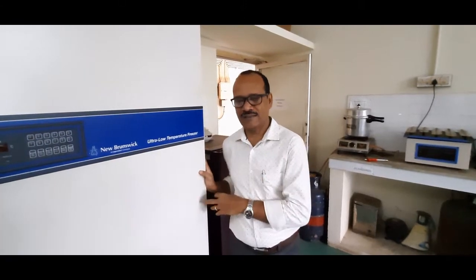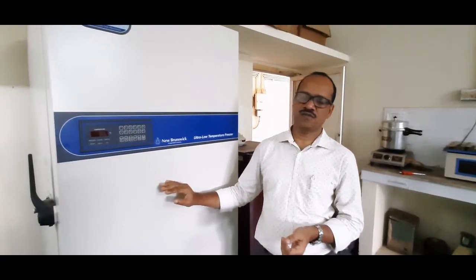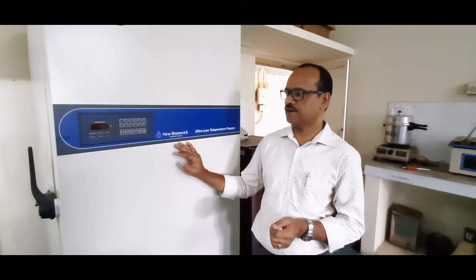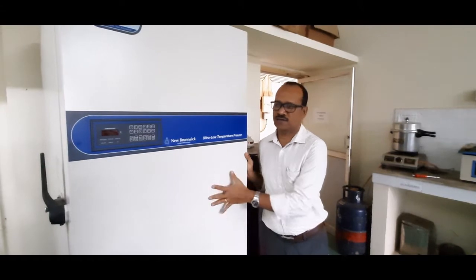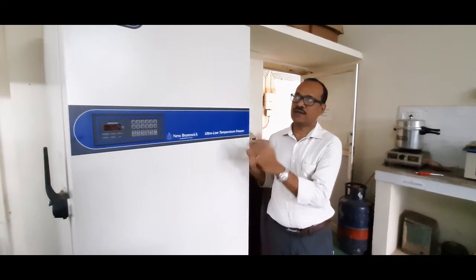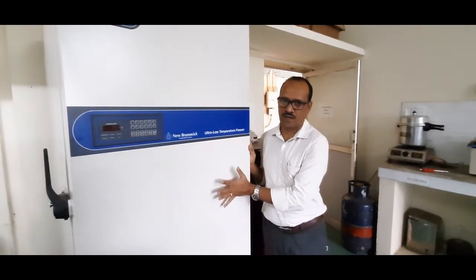Usually when we isolate nucleic acids from organisms, we take a sample for doing the experiment, and after that the stock sample has to be preserved for further studies. The minus 80°C condition is important to maintain. This is also important equipment to have in the molecular biology lab. Another important equipment is the rotary shaker, used for incubating cultures with agitation.